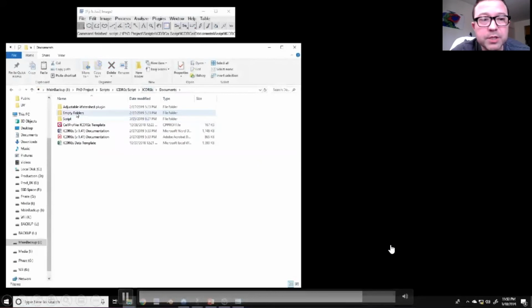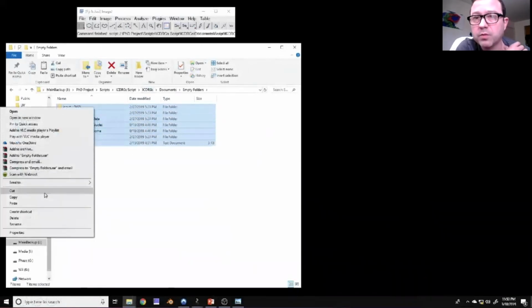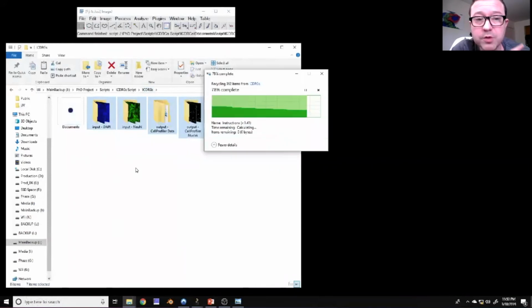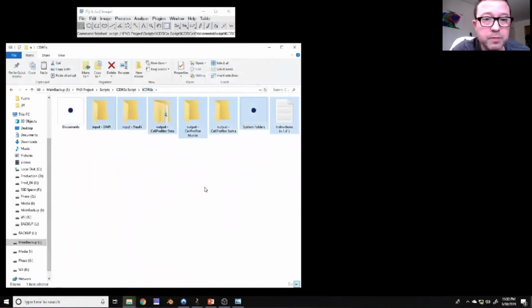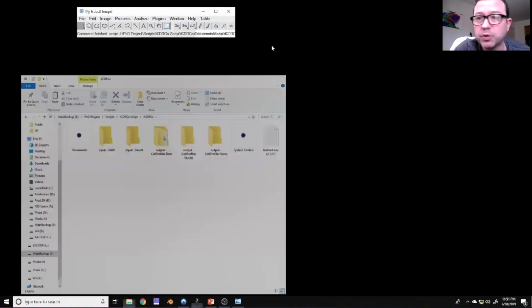And then here I'm showing how to easily repeat this algorithmic processing. Once you've copied the results to different folders, you delete them, and then you copy in the empty folders, and once you populate the NeuN and DAPI images, the algorithm is able to run again.